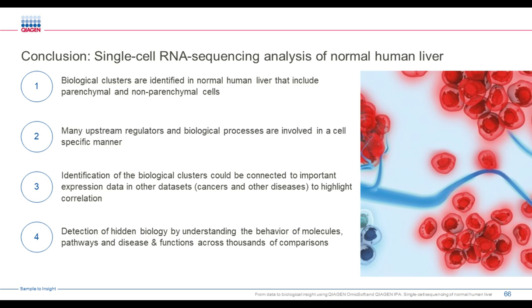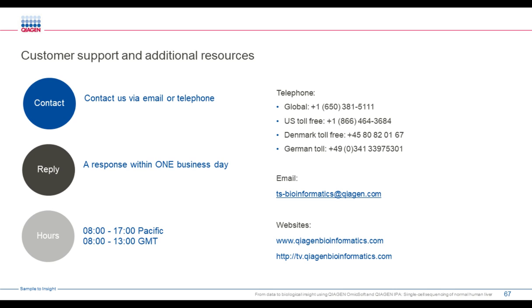To conclude, I hope I could explain that we can identify biological clusters easily in our single-cell project. We have identified many upstream regulators and biological processes that are involved in a cell-specific manner. We have identified biological clusters that could be connected to important expression data in other data sets, such as cancer and other diseases, to highlight some kinds of correlations. And we have also discovered hidden biology by understanding the behavior of molecules, pathways, and disease and function across a set of thousands of other comparisons.